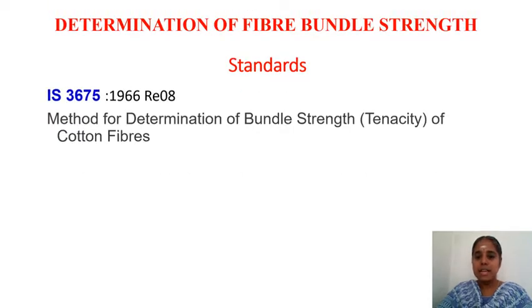The standard that is followed for testing in this instrument is Indian Standard 3675, method of determination of bundle strength. Tenacity is the term that you have to find out in this experiment. You have already known the definition for tenacity. It is specific stress at break, and it is done for cotton fibers.